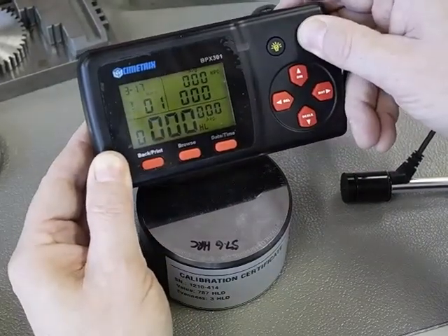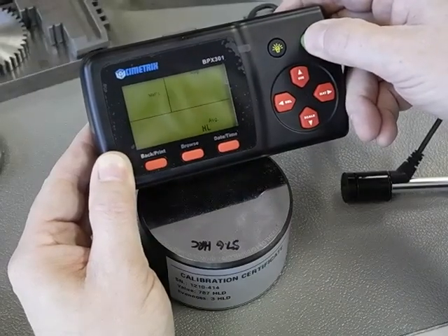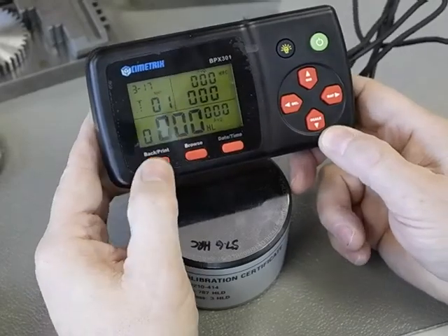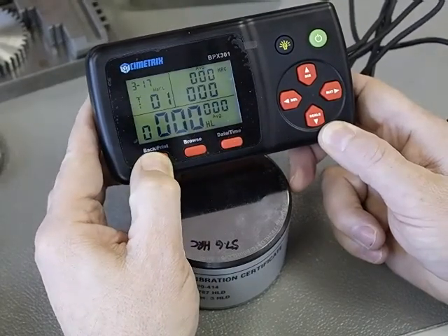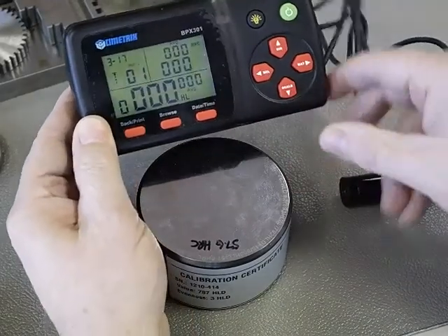Now if you had powered on fresh, your state would be with everything set at zero. Even so, to go into calibration you must hold the back print button down until the zero here flashes. Now we are in calibration mode.